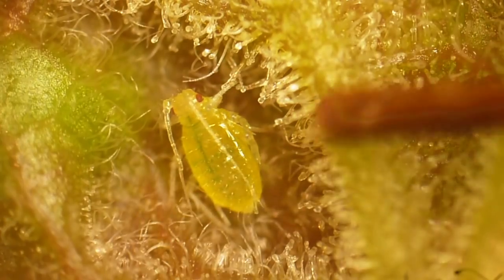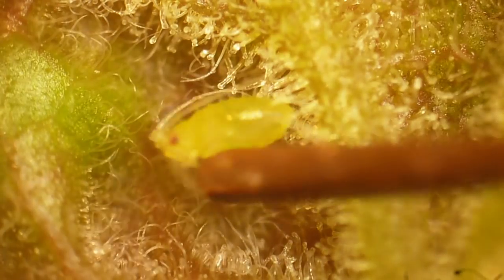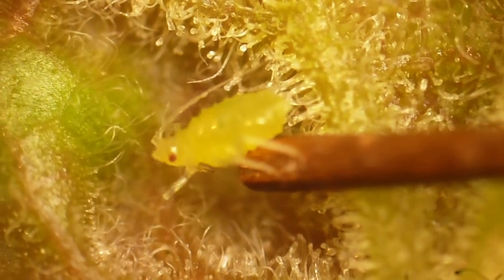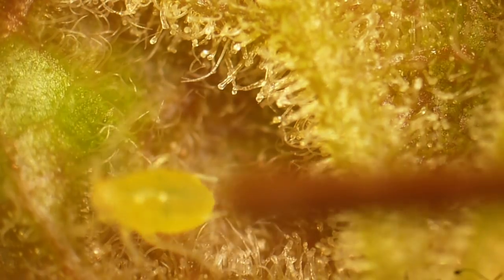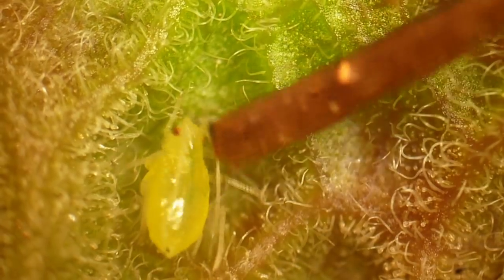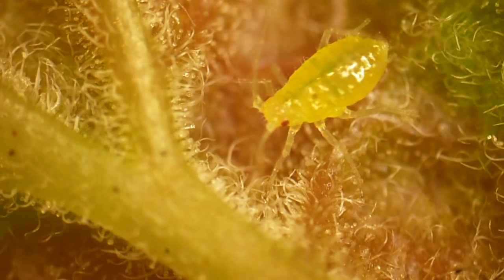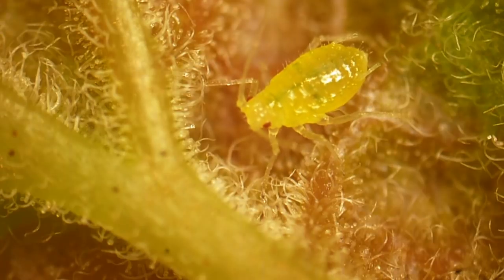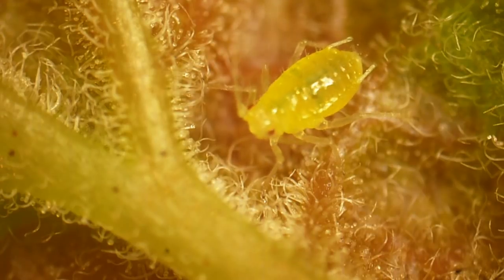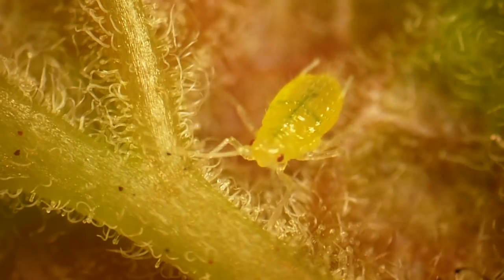So what I did is I took a little copper wire that I had lying around and I was poking the aphids a little bit, disturbing them during their lunch, and sure enough they started moving. This one is now trying to escape and run away — it doesn't like to be bothered. Another one: let's poke it a little bit here and it starts to move. You can see they are alive and they have huge antennae, really large ones.